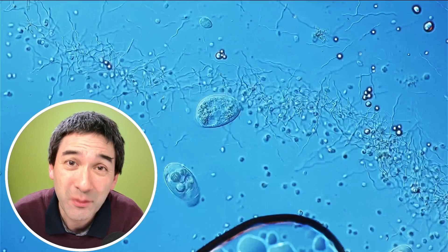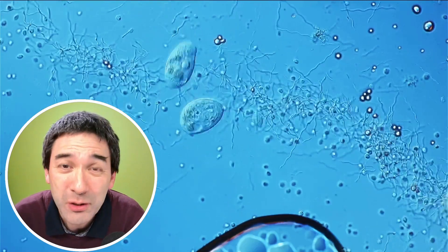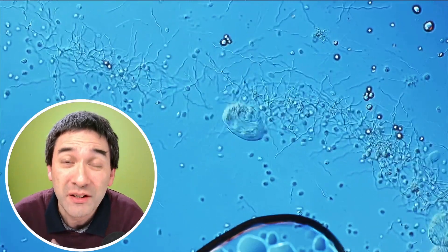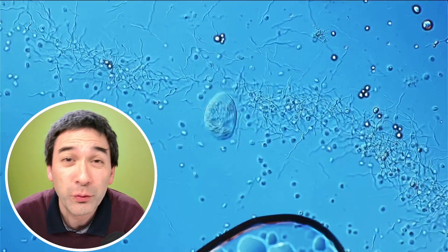Now when I saw those, of course, I was quite happy. Wow, great, some interesting bacteria! And those spirochetes are indeed quite large, therefore can be easily seen.